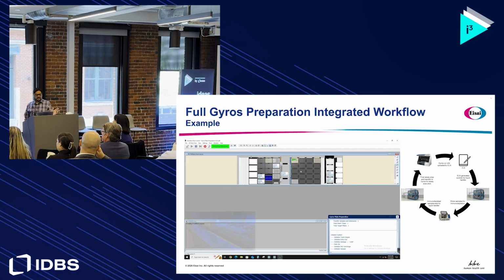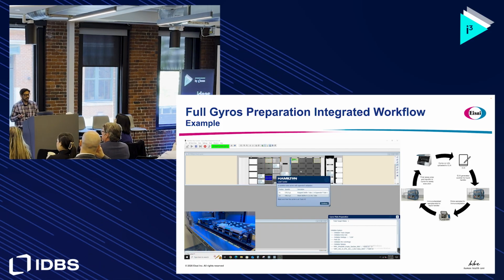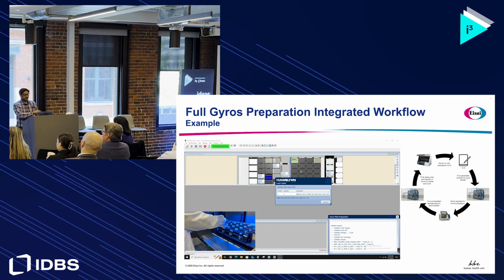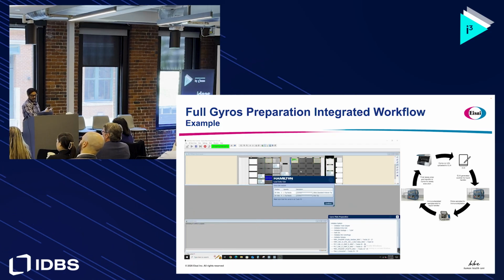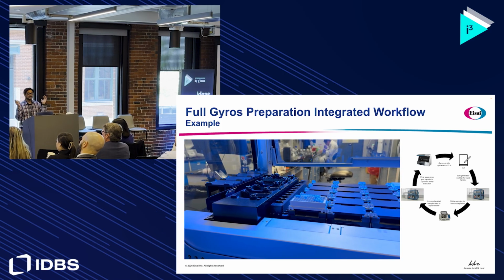So now we went through the process. We did the spreadsheet work. Now we get to the robot. The robot pulls those instructions, and it's going to show you the same things that the spreadsheet showed you. The difference is now you're in front of the robot. You're not in front of E-Workbook anymore, right? But the correlation is the same. They're telling you the same thing. You load the things up there. It doesn't even trust you at this point.